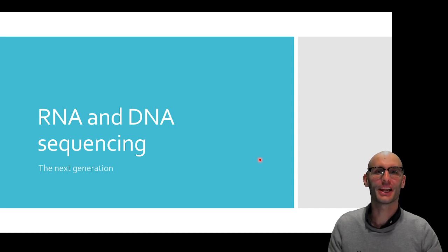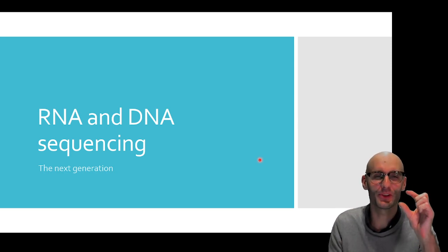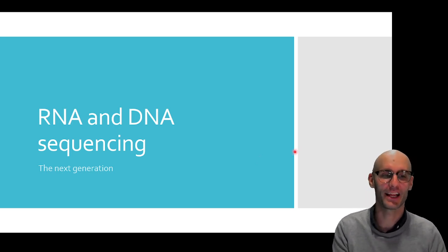Hey everyone, Dr. Jack Gordy here, and in this video I'm jumping into how does DNA and RNA sequencing work? The modern stuff, what happens when you send your samples off to get sequenced or run it in the lab? How are they sequencing that DNA and RNA? So let's jump into it.